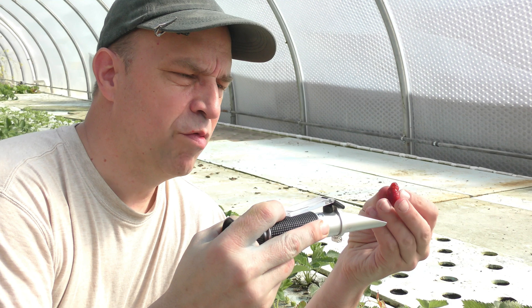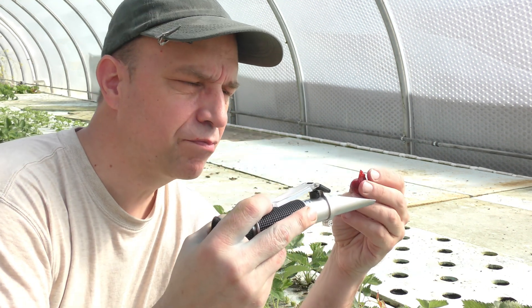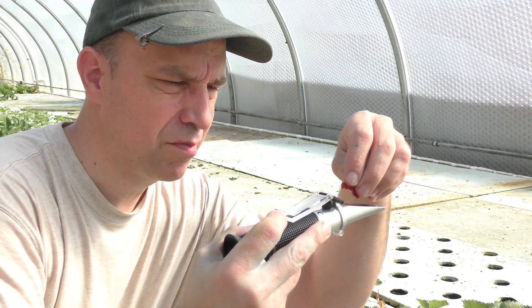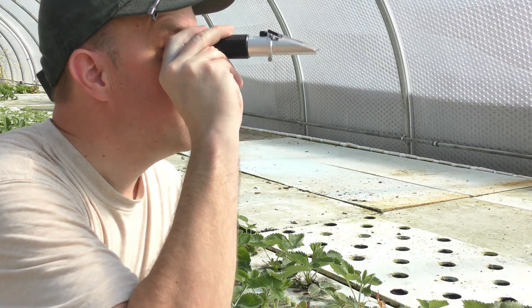On to our overripe one. Definitely overripe. Wow, that one is at seven, so that's not good at all.